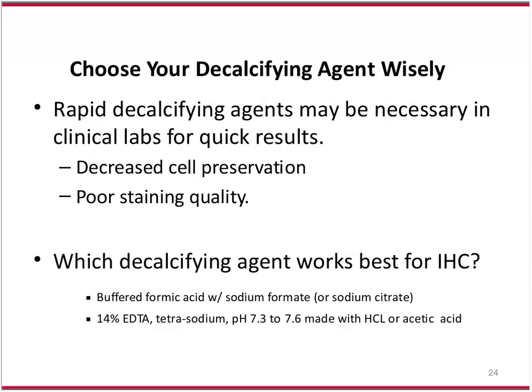So rapid decalcifying agents may be necessary in clinical labs for quick results. In our research lab, we don't have to have quick results. Obviously, we want to bring stuff in and turn it around and get it out as soon as we can. But in clinical labs, if that was your bone and it was sitting in EDTA for 2 weeks on the stir plate, that's kind of disturbing.